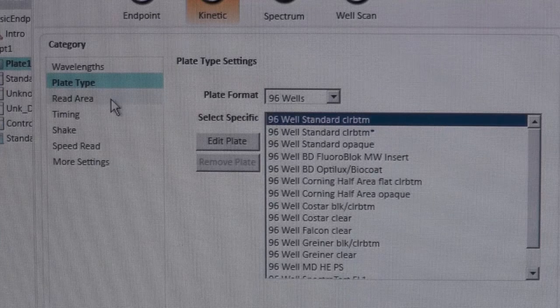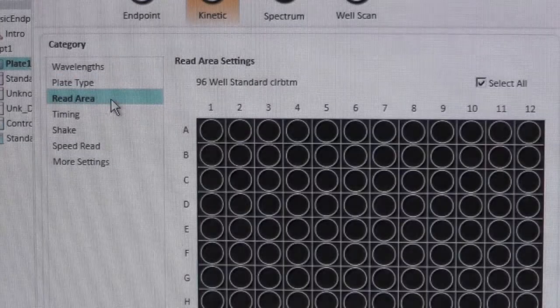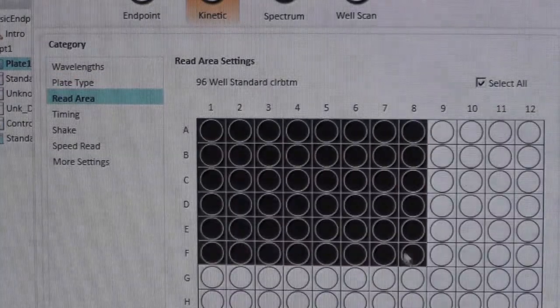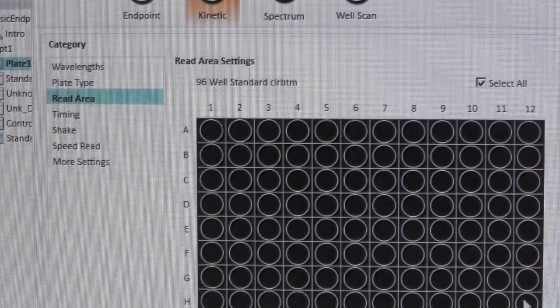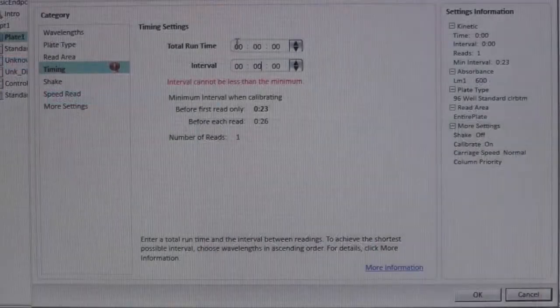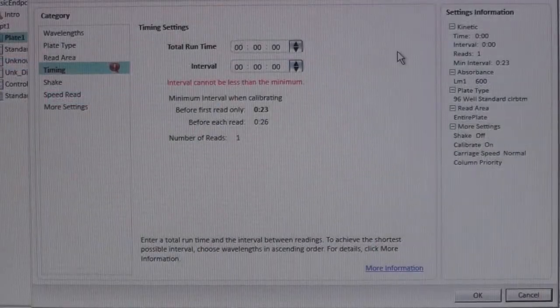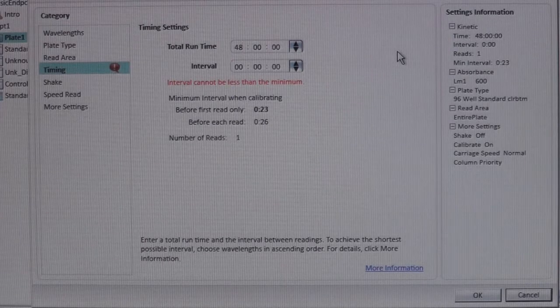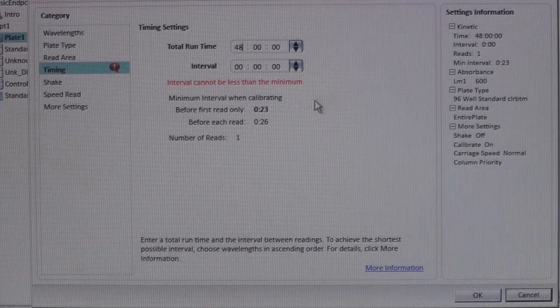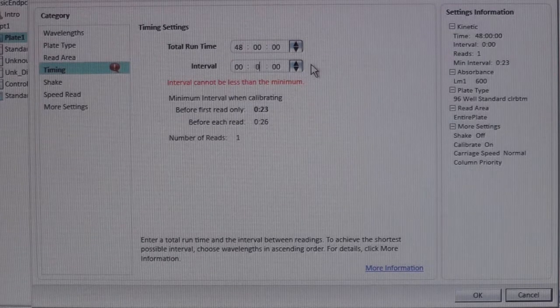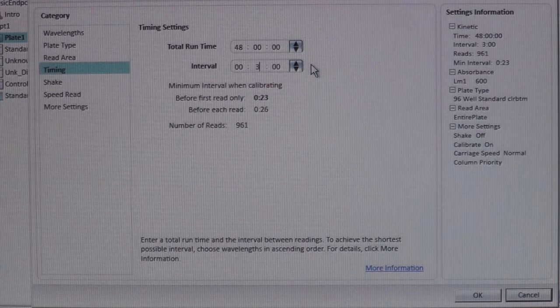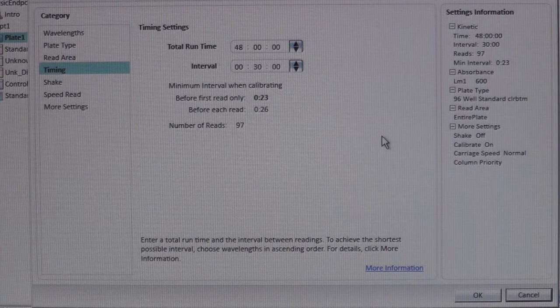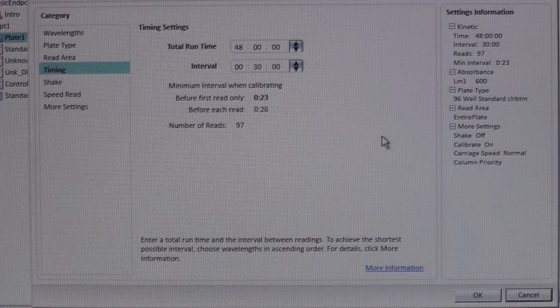For Plate Area, drag and select the wells you would like to read. For timing, the total runtime and reading intervals can be set. The timing here is shown in hours, minutes, seconds. After setting your timing parameter, the total number of readings will appear in the bottom.